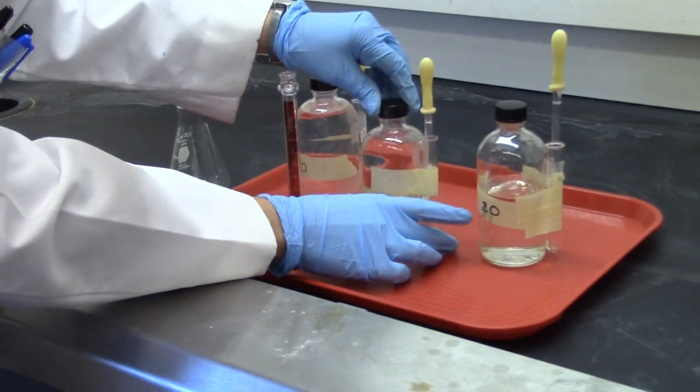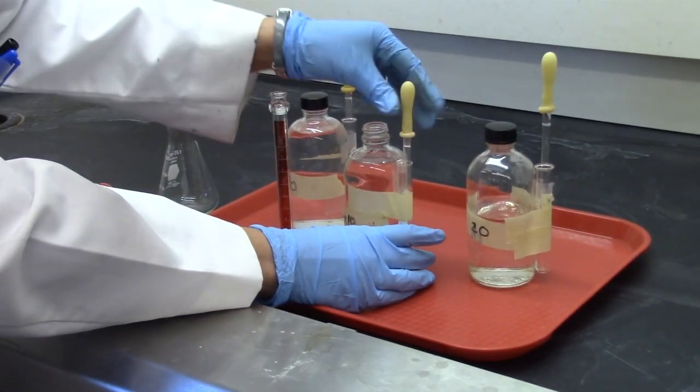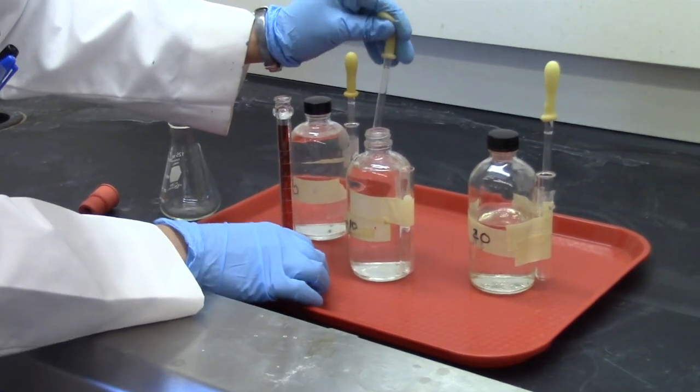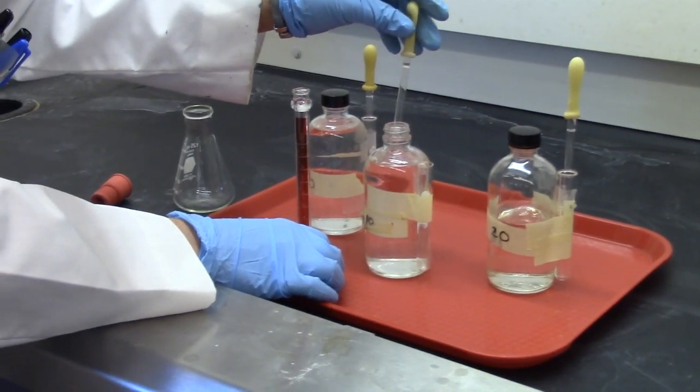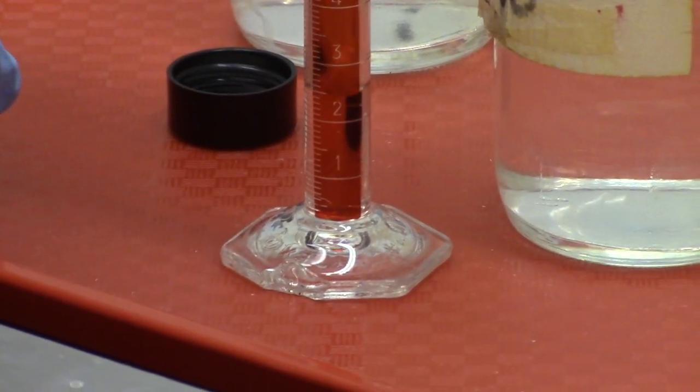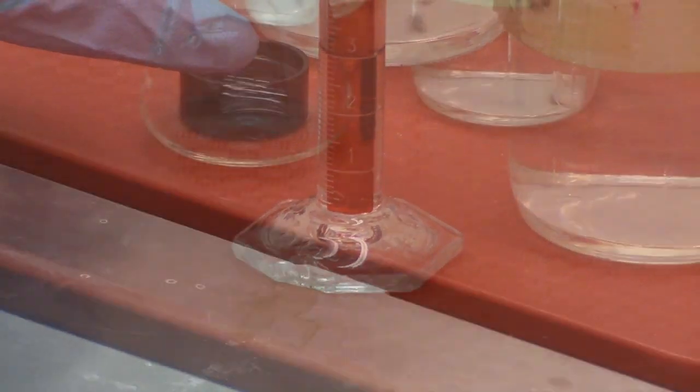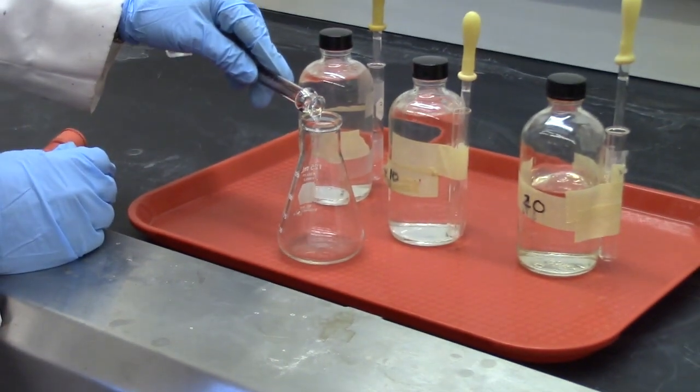Obtain about 3 to 4 milliliters of the unknown which is assigned to you by your instructor. Pour this into the flask and place the septum over the top.